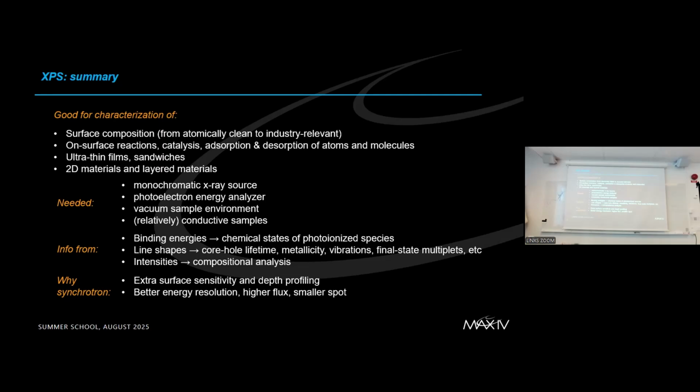We have many cases where companies are interested in studying certain surface compositions of, I don't know, steels or some other compounds on certain surfaces. And then it's just that the sample should not be very dirty. And then if you want, we can use high photon energy. Okay, we will look through the dirt into the sample, and it will still be possible to measure XPS. But in each case, it's a matter of trying.